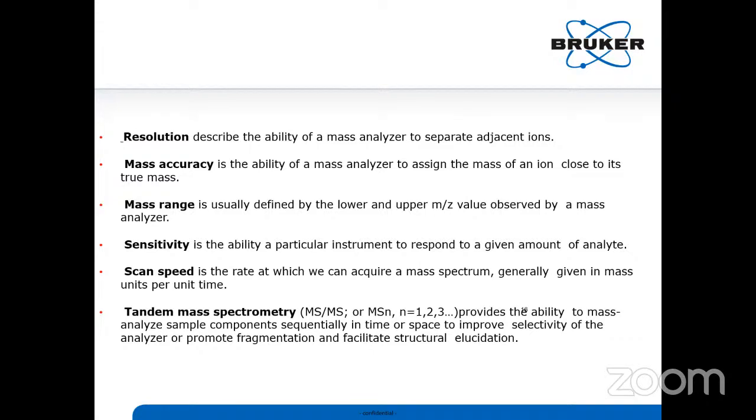You can say, yes, I'm already having front end LC. In LC, it will get separated. Yes, that is fine. It may get separated in LC itself by RT, retention time. But when you are checking any PTM studies, for example, you have one peptide with 2 different sites. Maybe you are expecting oxidation at one site, but the oxidation is happening at a different site. Your mass is not going to change. Why?